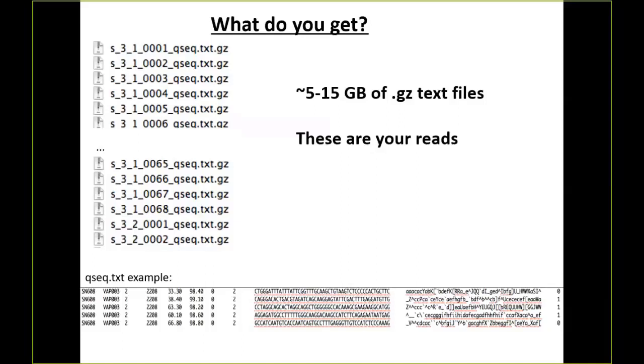I'm dealing with some SRA data, and some experiments seem to be paired end, but then I download the data and it looks like it's single. I don't know, maybe I'm wrong. A lot of times, you'll see this later on, because I'm going to give you some paired end data to play with in a bit. With paired end data, you'll get both ends as separate files. So you should get one file that's going to be read one and another that's going to be read two. But if I download the SRA file from NCBI, are there specific commands?